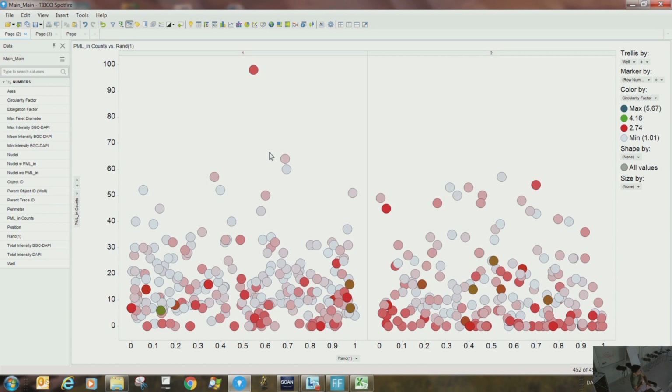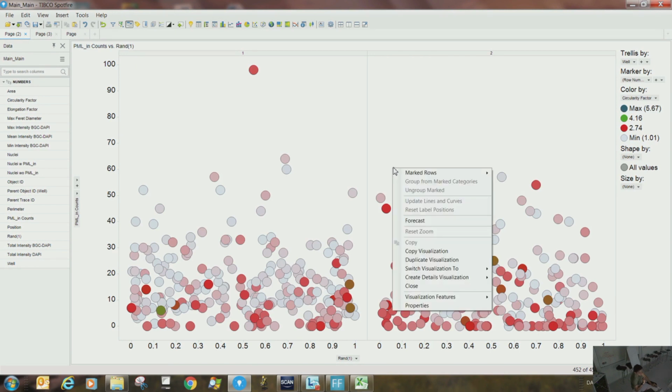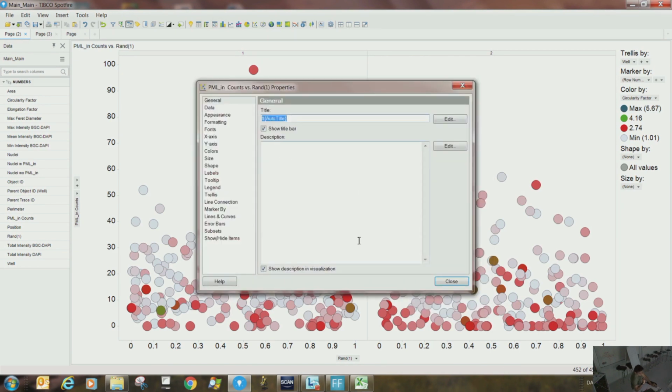For comparison, I will cover the box plot, the t-test and stuff like that. I will cover that point later. But this is only a limitation of Spotfire for the scatter plot. Okay, but maybe I'm interested in knowing the median value. I would like to also display a horizontal line which represents the median value of the y-axis. That is also possible. So how do I do this?